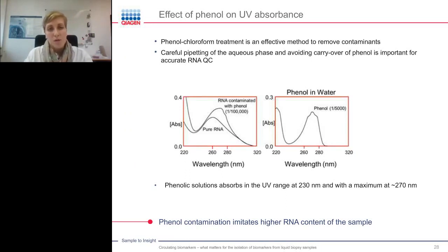What is also important to remember is that phenol can have an effect on the UV absorbance. This is probably not so relevant for liquid biopsy, but it is important for other RNA isolations that you are performing. In these graphs, you see the absorbance spectrum of phenol, and you see that the phenol spectrum overlaps with the spectrum that you would expect from pure RNA.